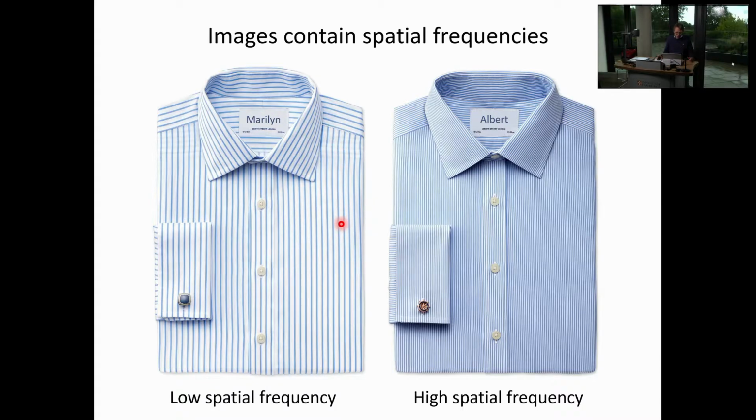What is it along the Y direction? Well, along the Y direction, it's obviously 0, okay, because nothing's changing if I go up in this direction here. So in fact, this shirt can be pretty well described with one spatial frequency, which is 2 lines per centimeter, and you get the pattern in this direction, and you don't do anything in the Y direction, so that gives you the set of vertical lines.